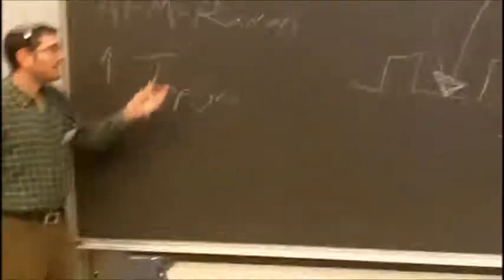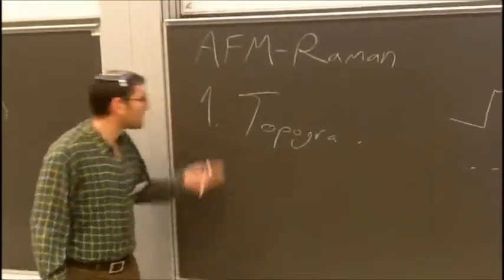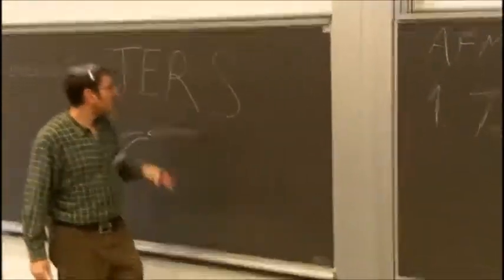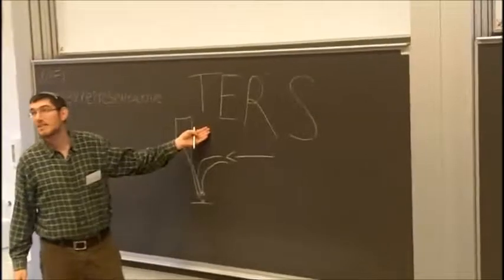So that's about integrating AFM with Raman. Okay, so we have the topography, we have a better feedback to get better data of the spectrum, and we have also the tip enhancement.